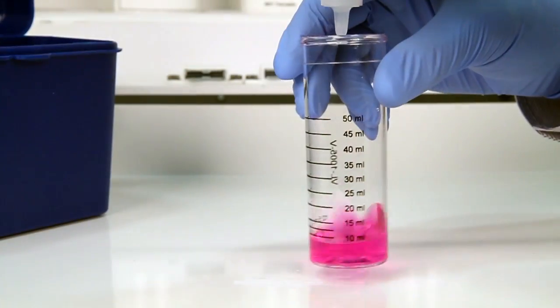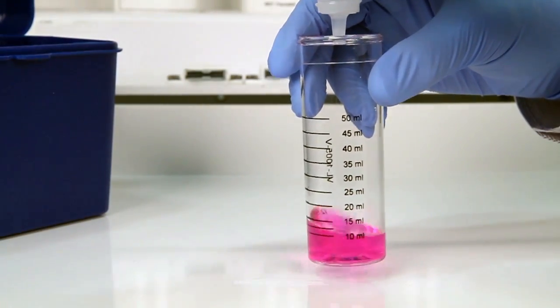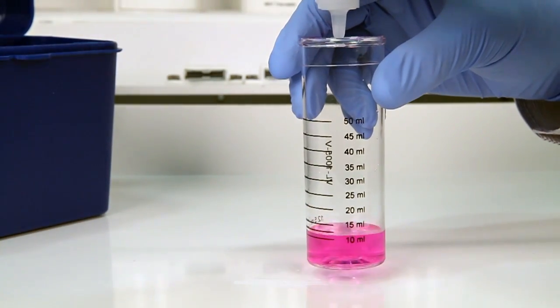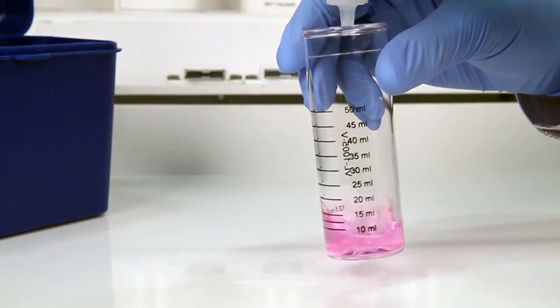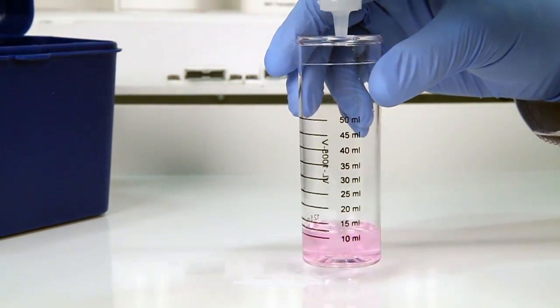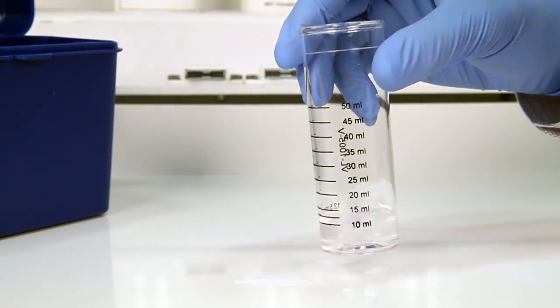After the addition of each drop of titrant, swirl the vial to make sure the sample is properly mixed. Count the number of drops during this step. The titration is complete when the sample changes from pink to clear.